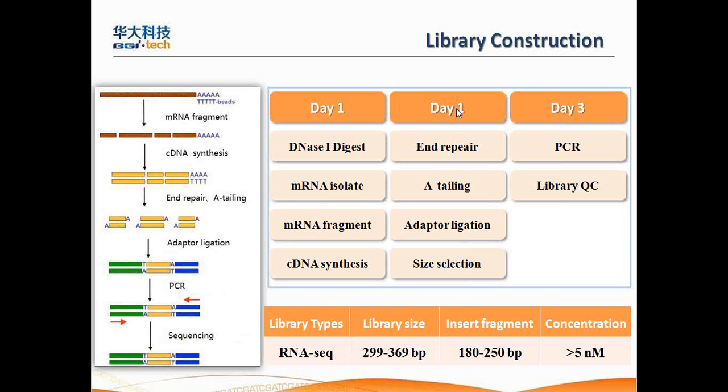So here, this should be day 2. I'm sorry for this mistake. So this is how we did the library generation. And after we got this library, there will be a quality check. And this is some standard of our quality check.